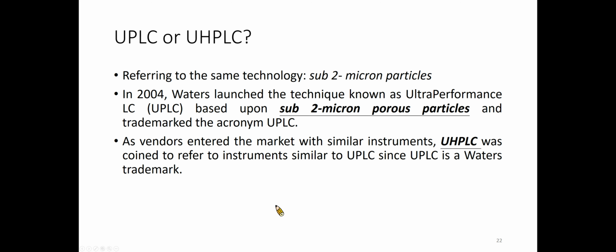You may hear the other term, UPLC, which is actually referring to the same technology. The only difference is that UPLC is Waters Company's trademark.